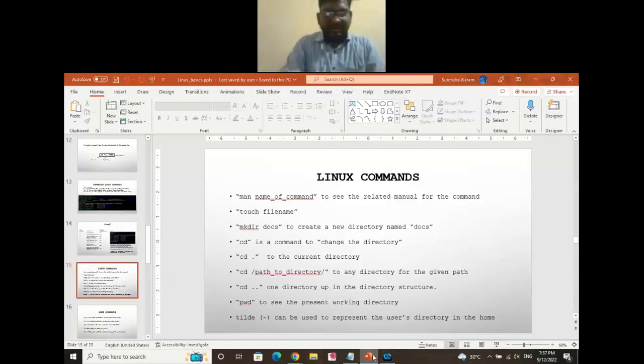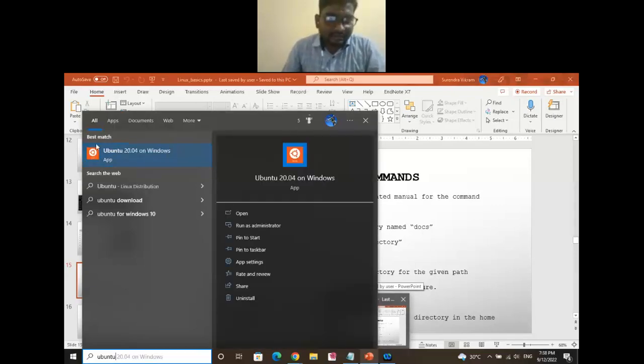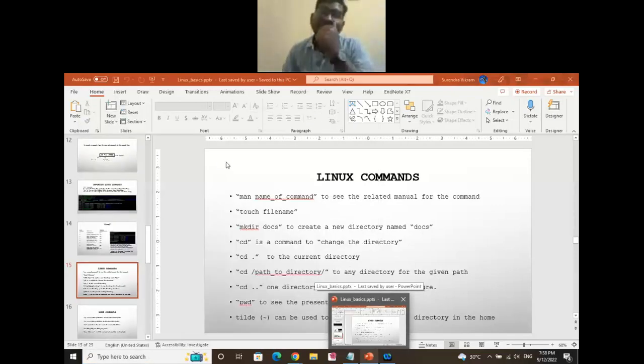So let me open Ubuntu. You can run it here by typing Ubuntu and then running it as WSL.